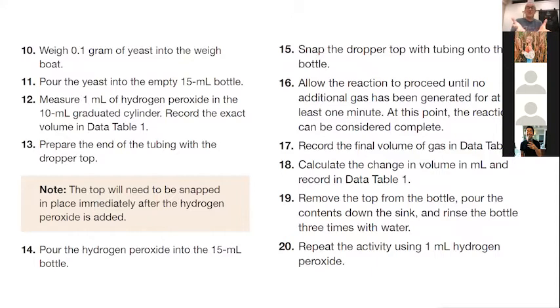The reason it's not important is because you're adding an enzyme. The enzyme doesn't actually affect the overall reaction. It makes it go faster, but you're still going to convert 2 moles of hydrogen peroxide into 1 mole of oxygen gas. You're just going to do it faster.